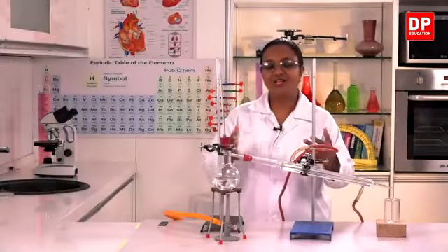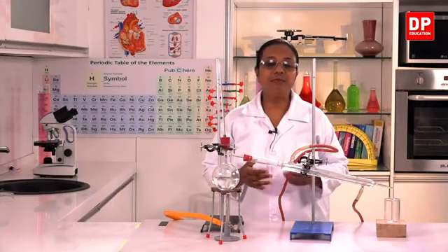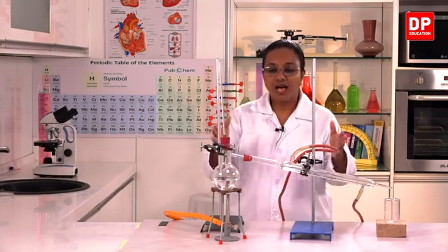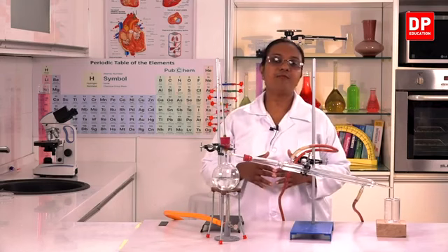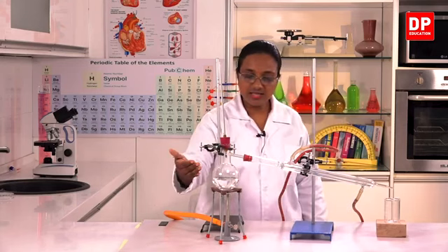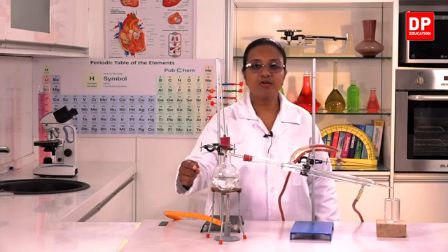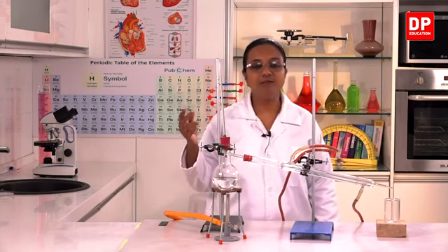Okay students, so now I am going to show you all the process of simple distillation. I have prepared the setup for the simple distillation process. Here you can see there is a round bottom flask. Into this round bottom flask, we will be taking water.